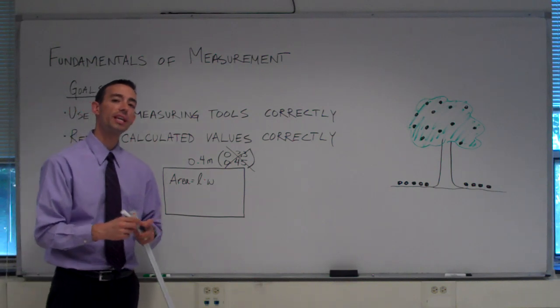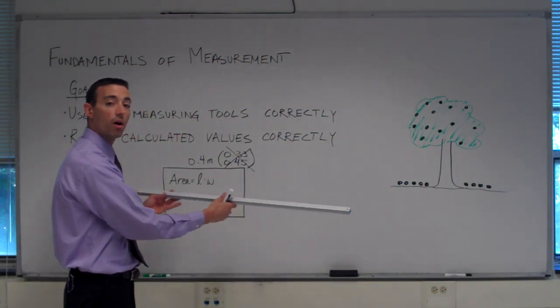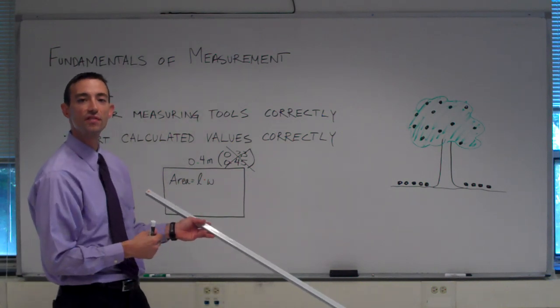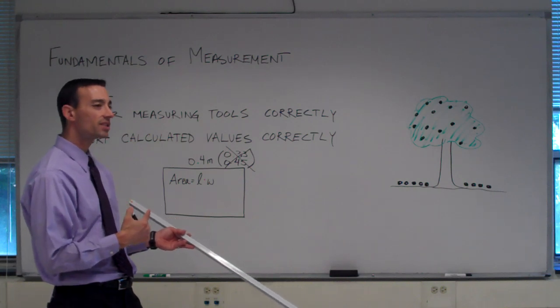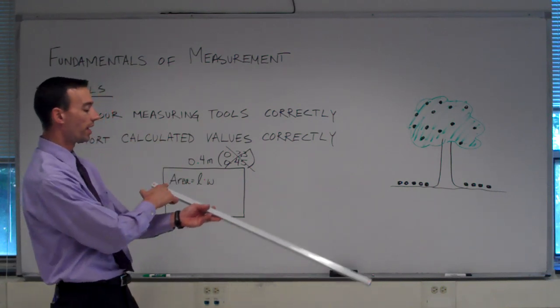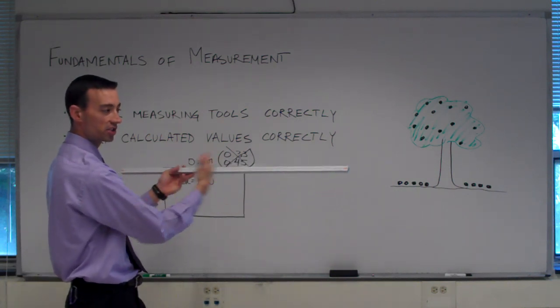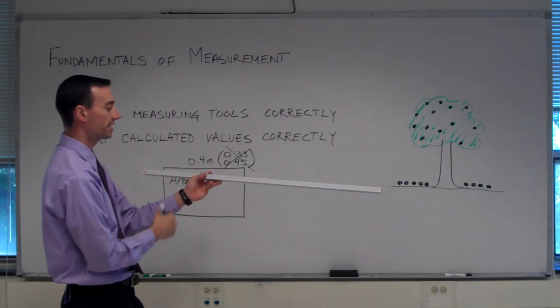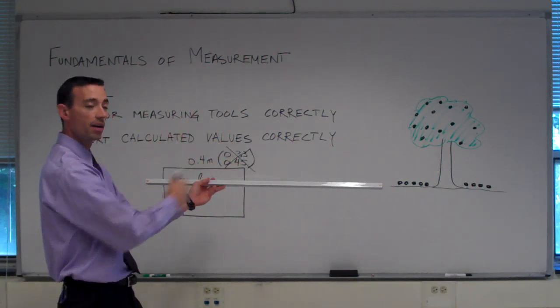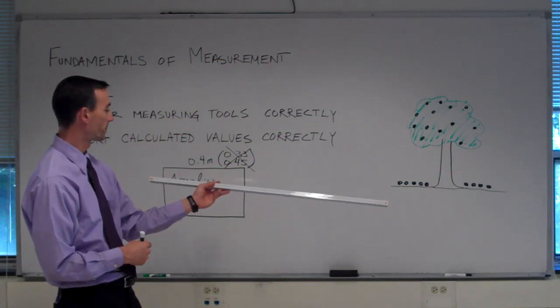The rules for using any measuring device with a marked scale are to record all of what are called the known places of certainty, plus 1 guess, 1 estimation, where you mentally divide the end of that scale, the last 2 markings, into 10 divisions and estimate how many increments are included in the measurement.